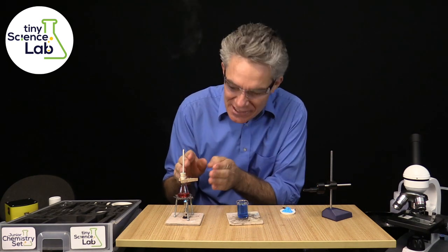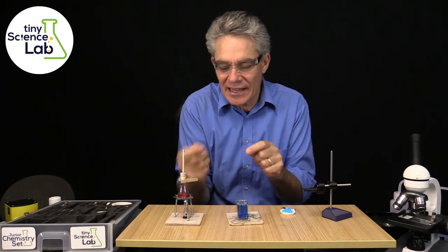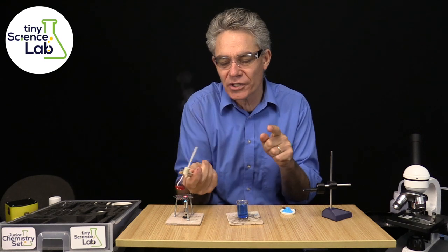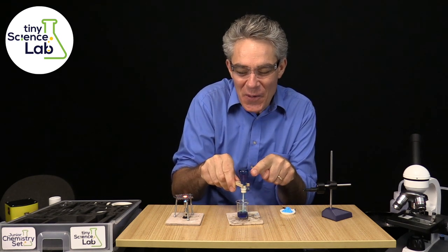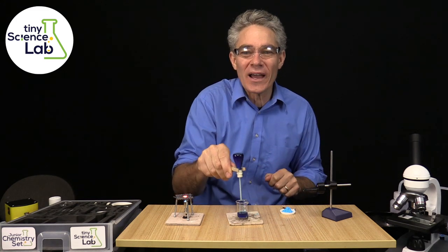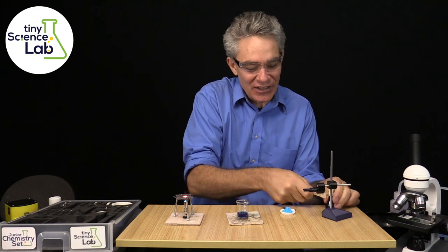I've got a conical flask here — it's boiling away. I'm going to invert it into this 10 ml beaker. Watch carefully. Whoa, look at that — the water is pushed up into that conical flask.